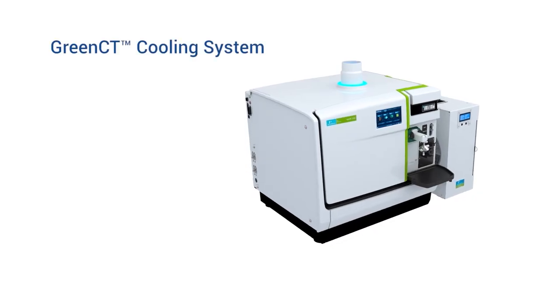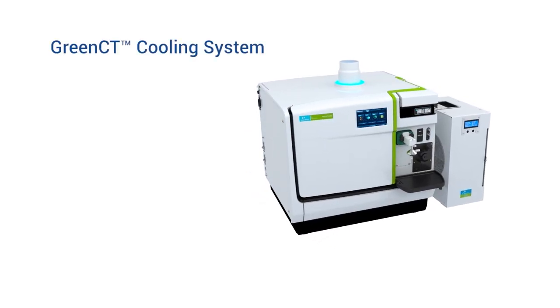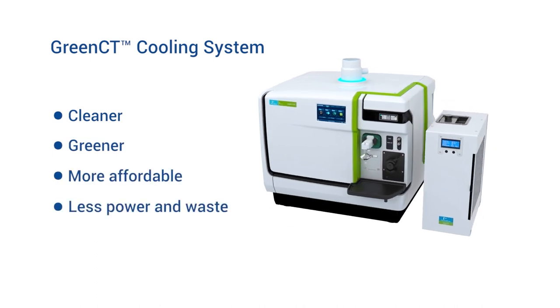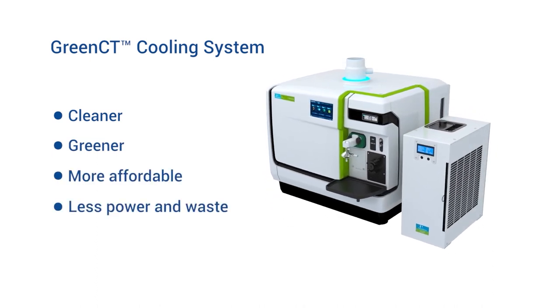And the revolutionary GreenCT cooling system uses a cleaner, greener, more affordable coolant, consumes less power, and generates less waste.